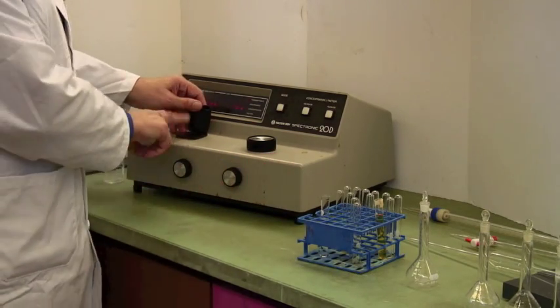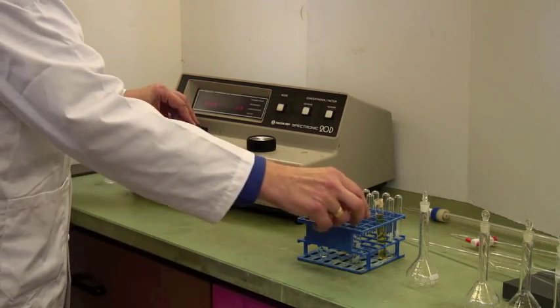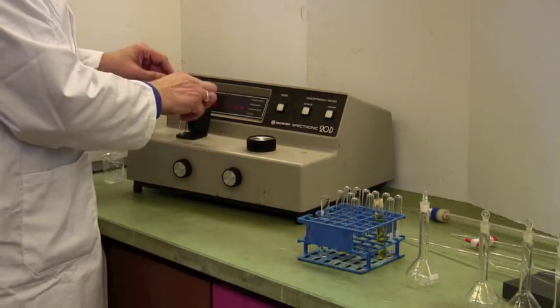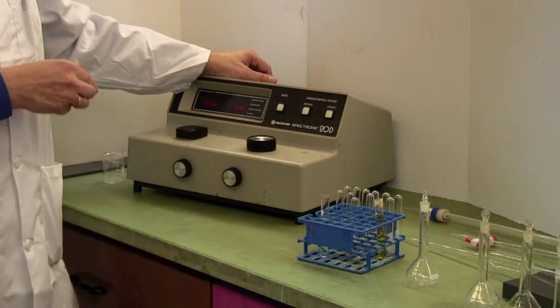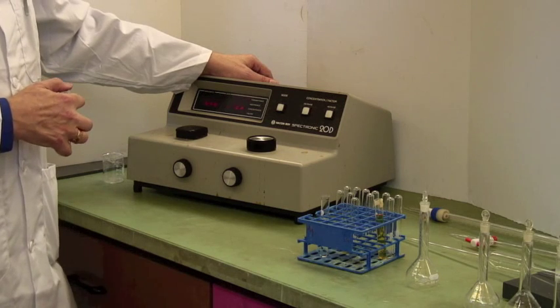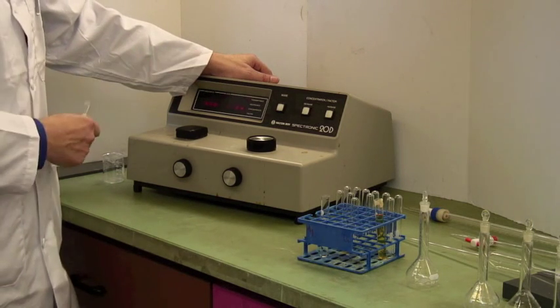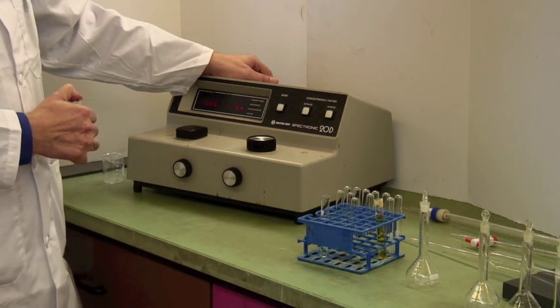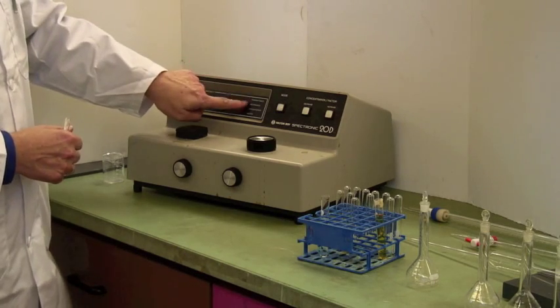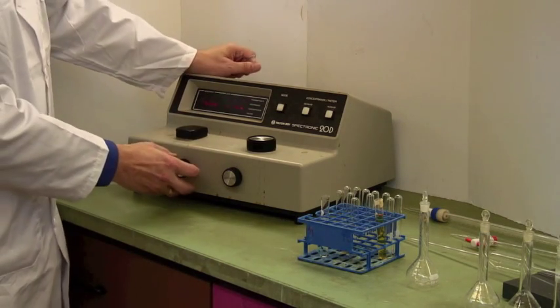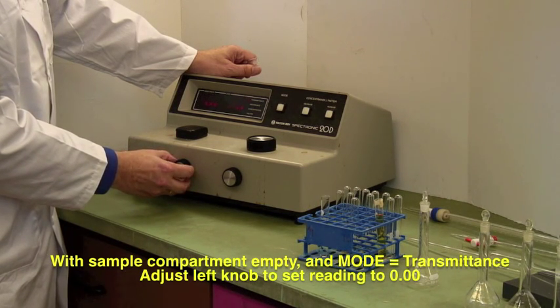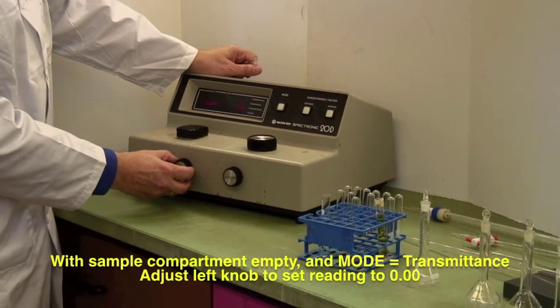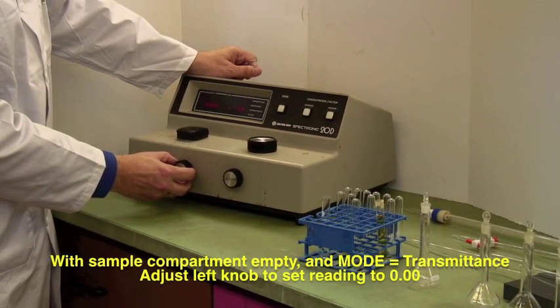Now, the sample compartment is here, and if you listen, when there is nothing in there, there is a shutter in the light path. So there is zero light getting as far as the detector. So with this in transmittance mode, I adjust this so that I have got zero percent of the transmission of the light being transmitted to the detector.